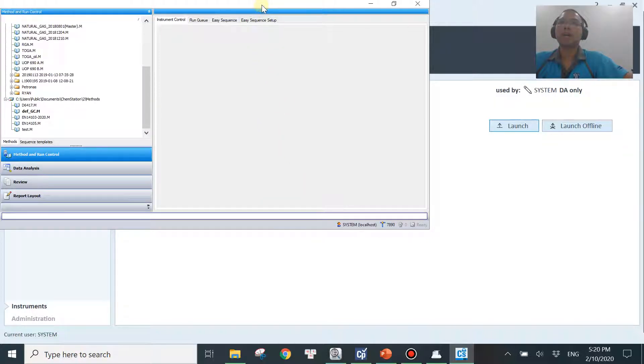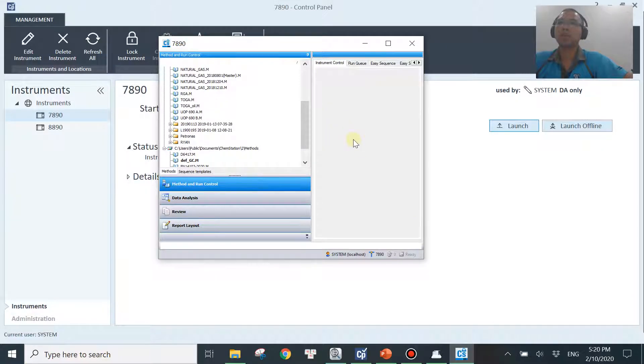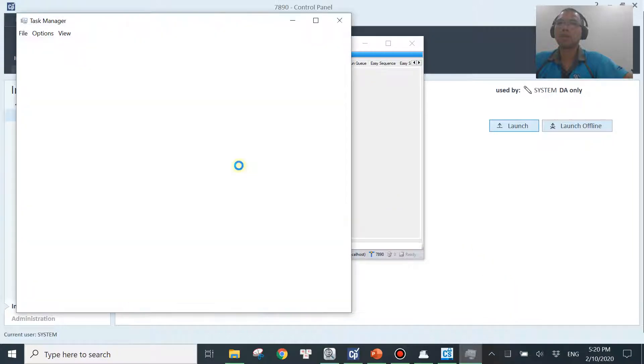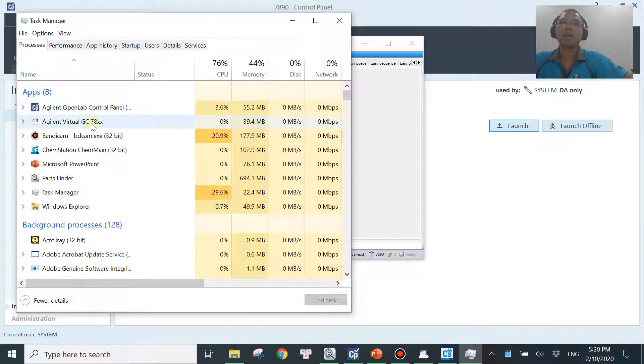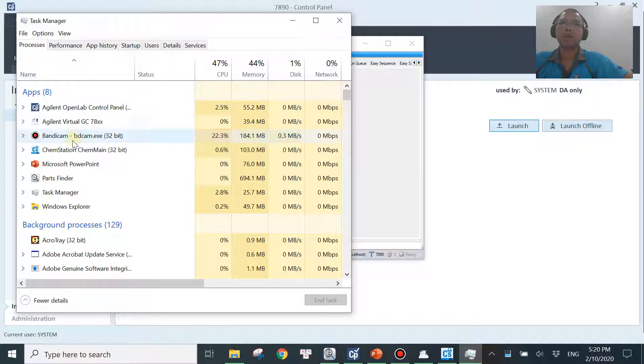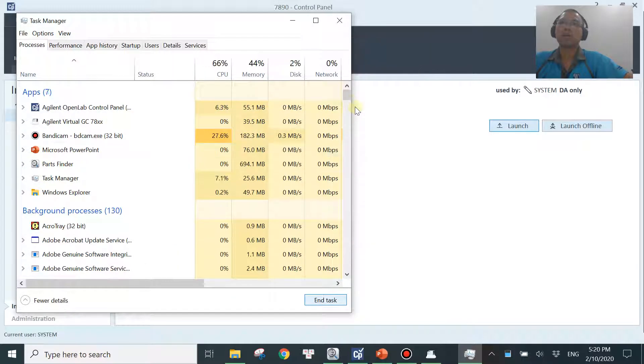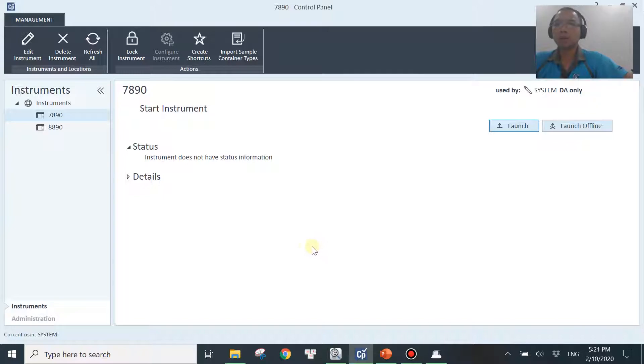Then the software will go into something like this, but it doesn't look normal. And I'm going to close the software and it's kind of hanging over there. So I need to go to Task Manager and close the software from here. Alright. So let me show you how to fix the issue just now.